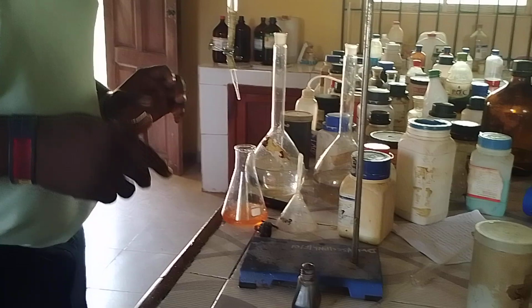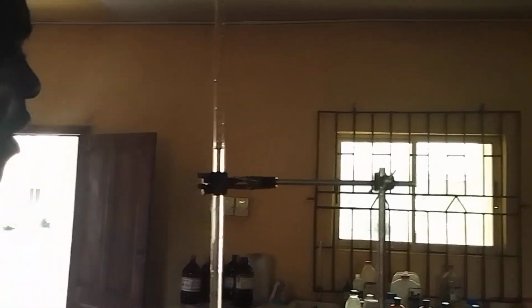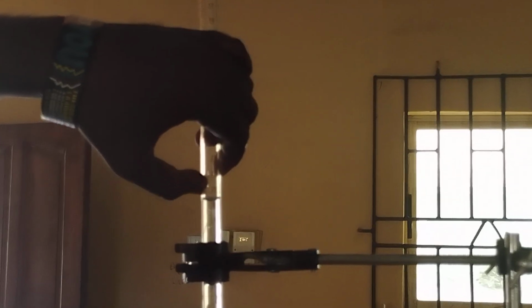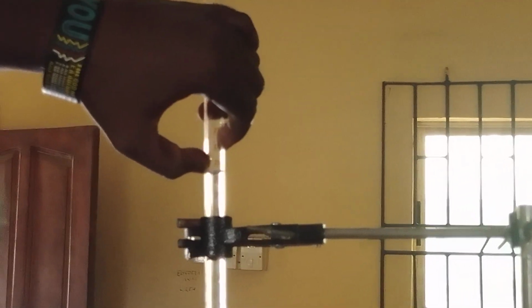So what I have here is quite totally different from what I used to have before. This one is 29.1, 29.2, 29.3, 29.4. So that is 29.5, this longest line. 29.5. 29.50.